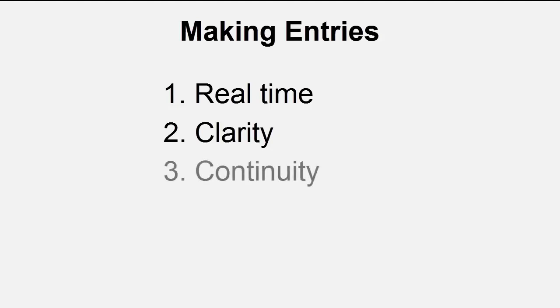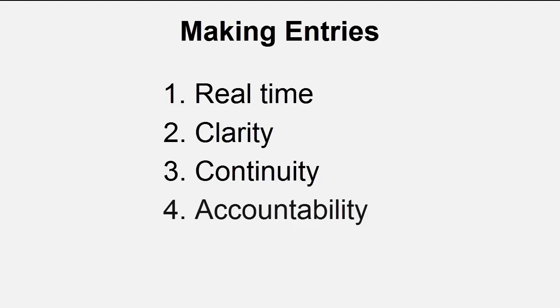The next point to remember is that there needs to be a sense of continuity in your laboratory notebook. What this means is that there should not be any empty spaces, and you should always write on both sides of the page. If for some reason you need to leave a page empty, or you need to leave a large gap in your laboratory notebook, it's important that you draw a line through that area and initial and date to show that you intended to leave that space blank.